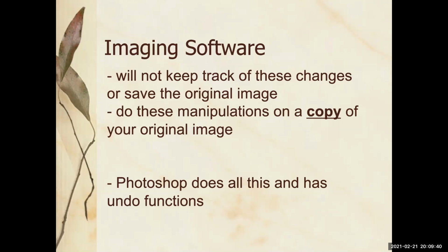Or in our case, we don't have the way to pay them every month. So that's what's holding us up. But if you have Photoshop, you can have fun with it in Photoshop too. And just be careful because 99% of what Photoshop does is not legit for science. But of course, if you can do gamma in Photoshop, that's fine too.